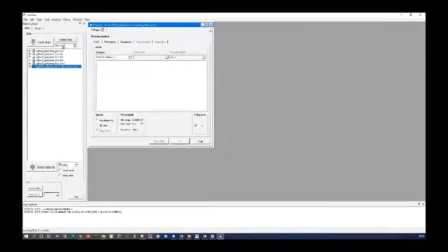And then there's a combo box here that is capable of filtering some of these files and either selecting them or unselecting them. So I'm going to unselect them all. And then I'm just going to select the 2-column data. And you remember, this is the worst of the minimalist formats. And then I'm going to send that data to fitting. So its name now appears up here in the fit page.